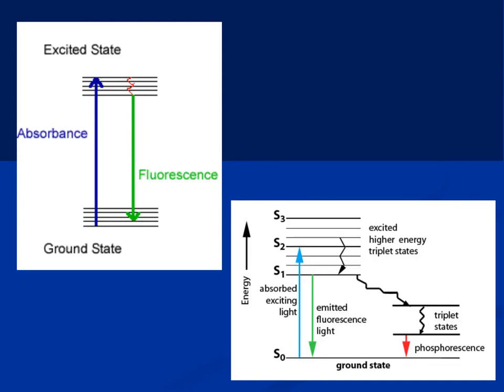And then the emission, as I told you, is in every direction. It's not in the path of the light, so it can be everywhere. So fluorescence light can be emitted in all directions, and that's measured. This is emission spectroscopy, so it's measured there.